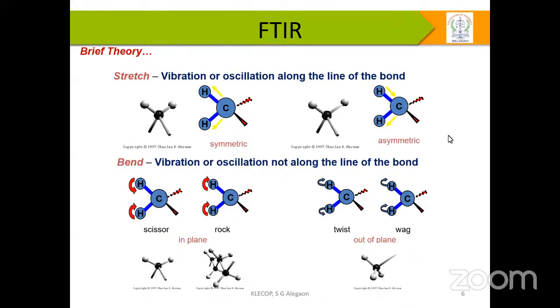Stretching, all the vibrations we can observe in 3600 to 1500 reciprocal centimeter, and these are very important, assignable, and you can very easily differentiate from one functional group to another functional group.